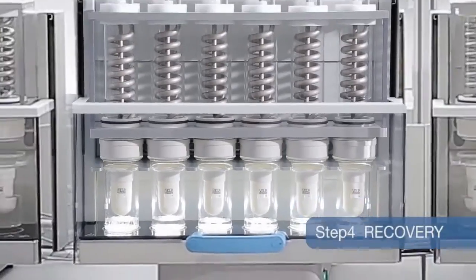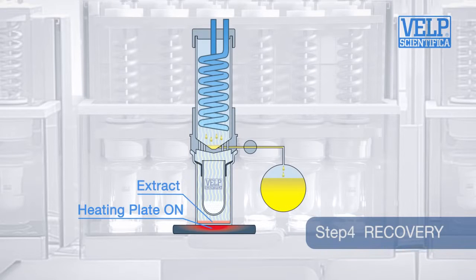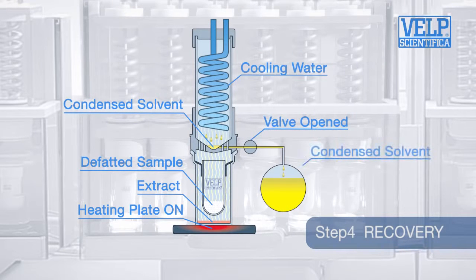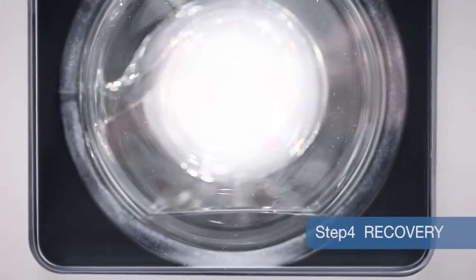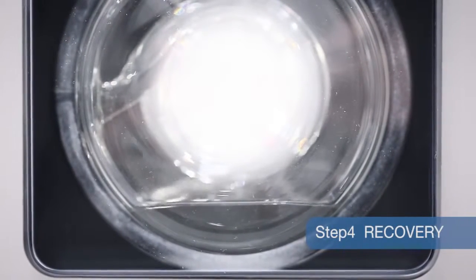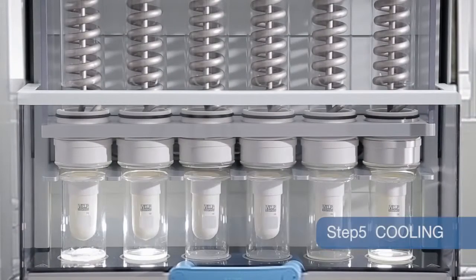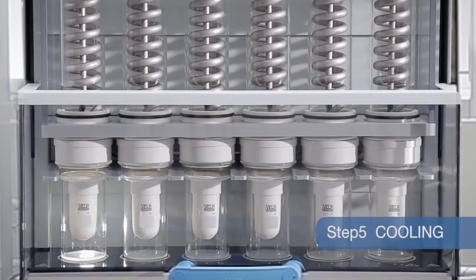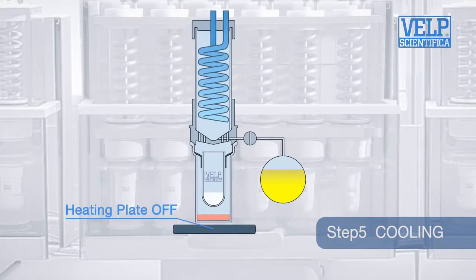The fourth step involves solvent recovery. Approximately 90% of the solvent used is collected in the internal recovery tank. The final step is the cooling of the extraction cups containing the extracted matter.